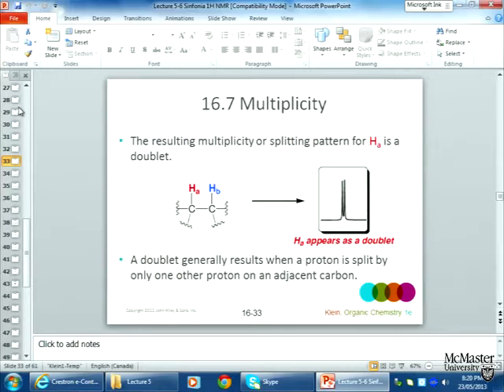And so we can then go to that carbon bearing the 1 hydrogen and we can say, well, what's its chemical shift? That tells us about its functionality, functional groups. And we can begin to piece the whole structure together by looking at multiplicity, by understanding not the number of protons at a site, but the number of protons at the neighboring site.